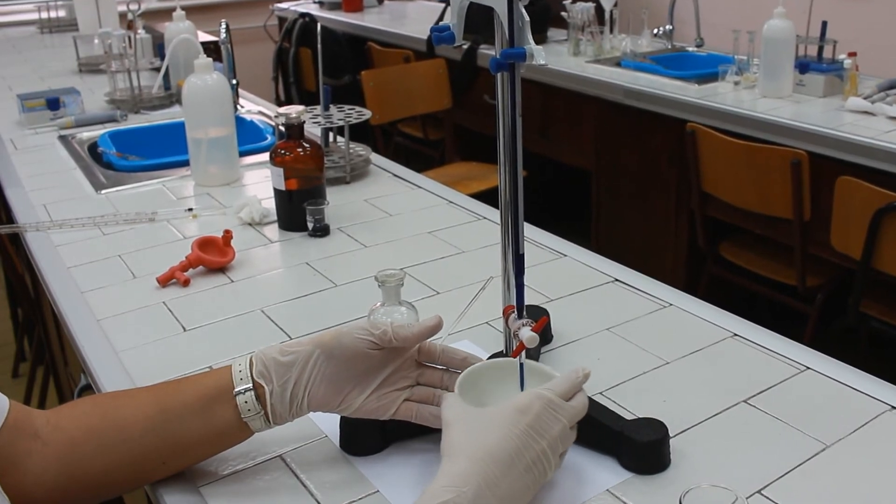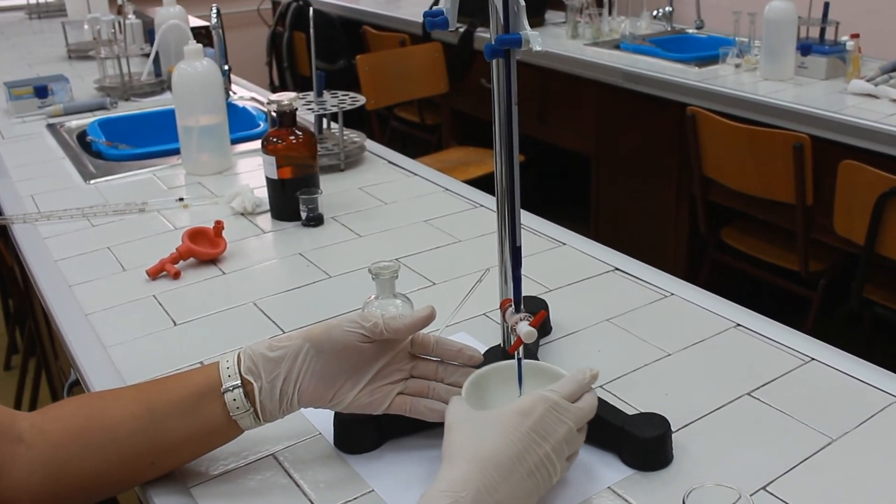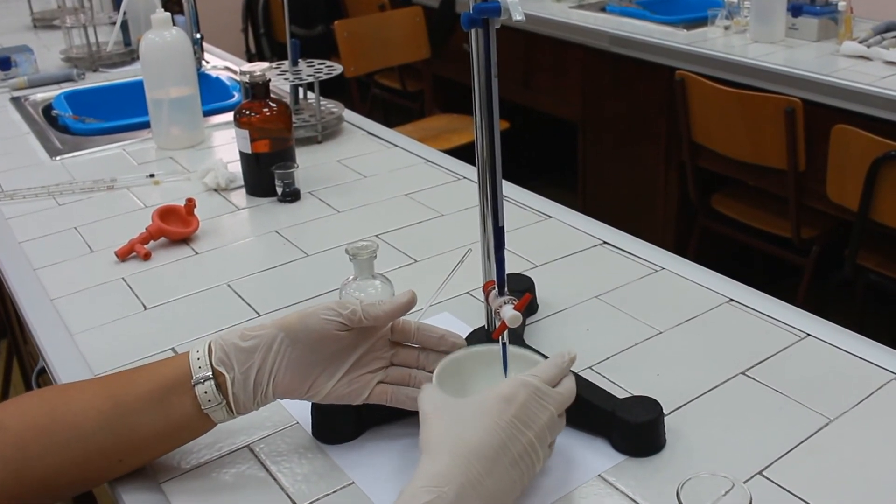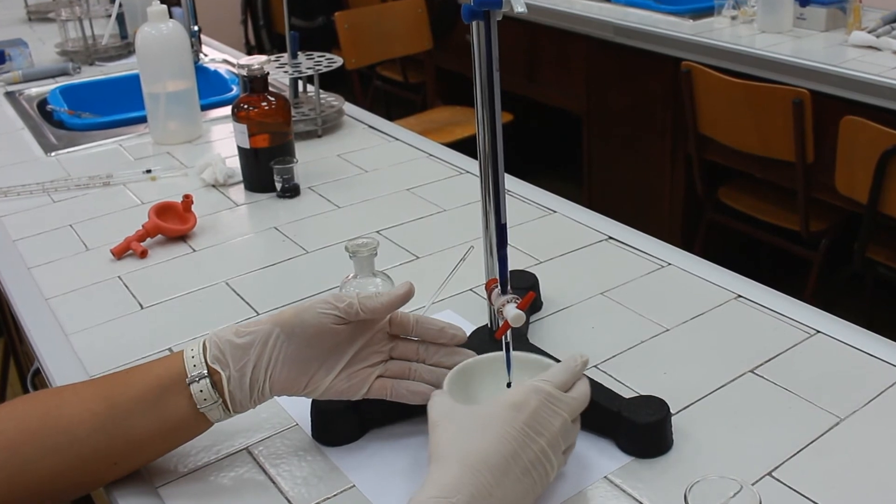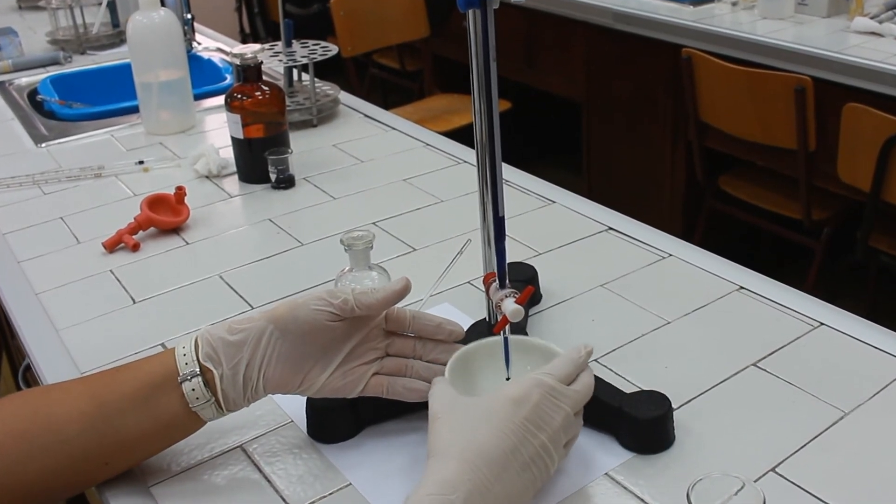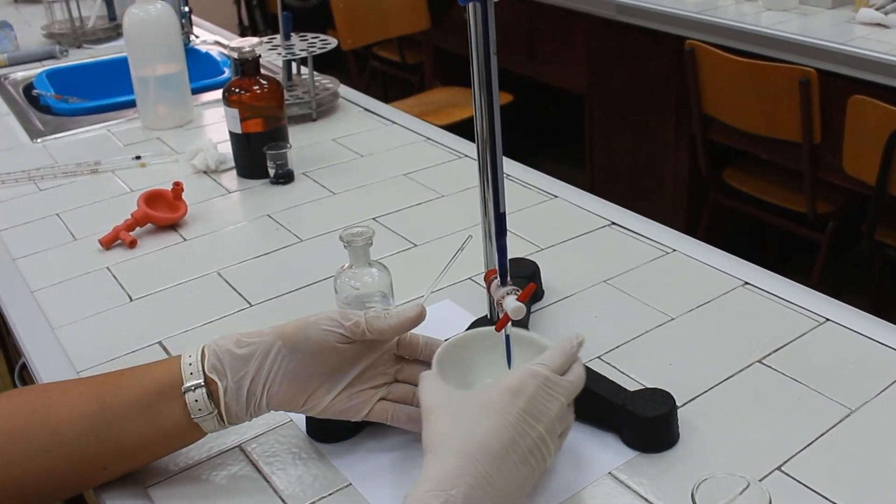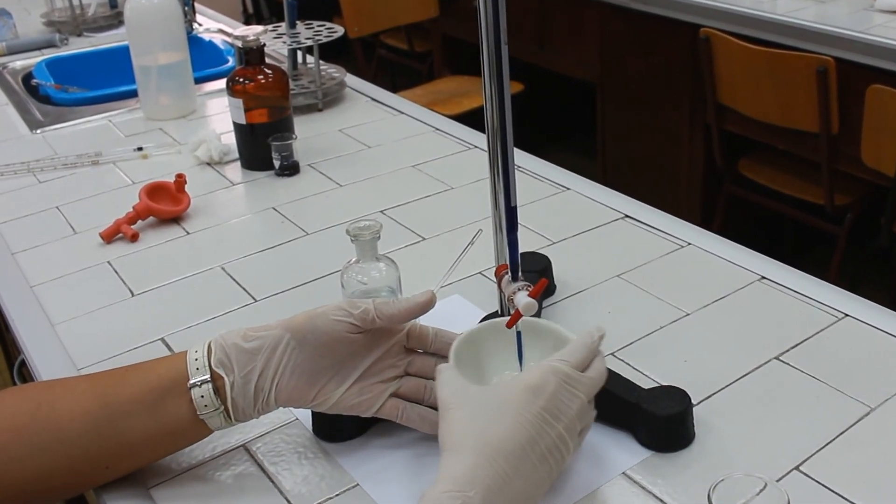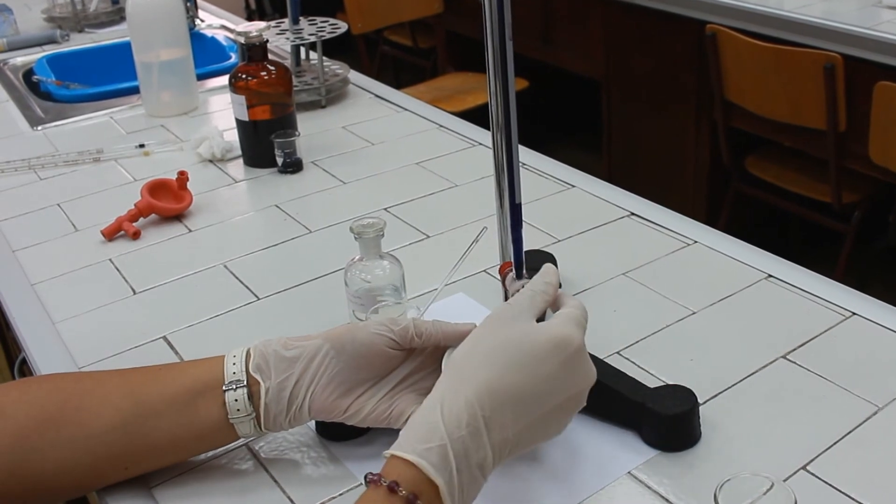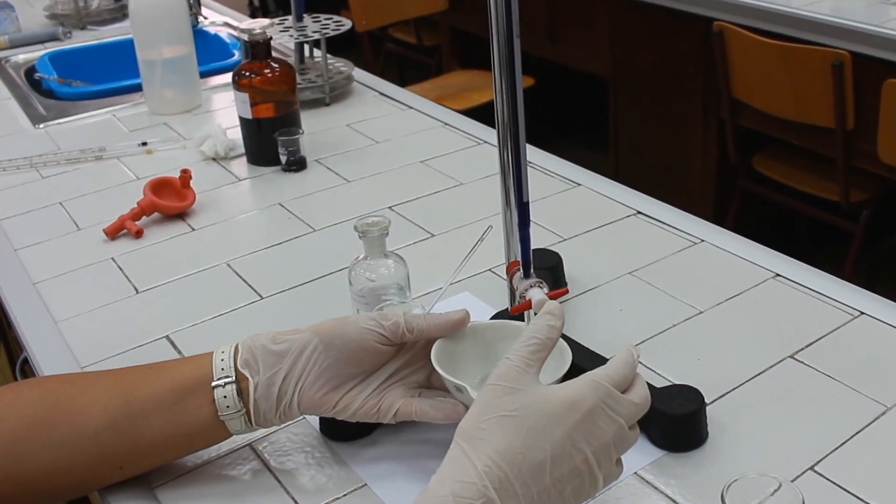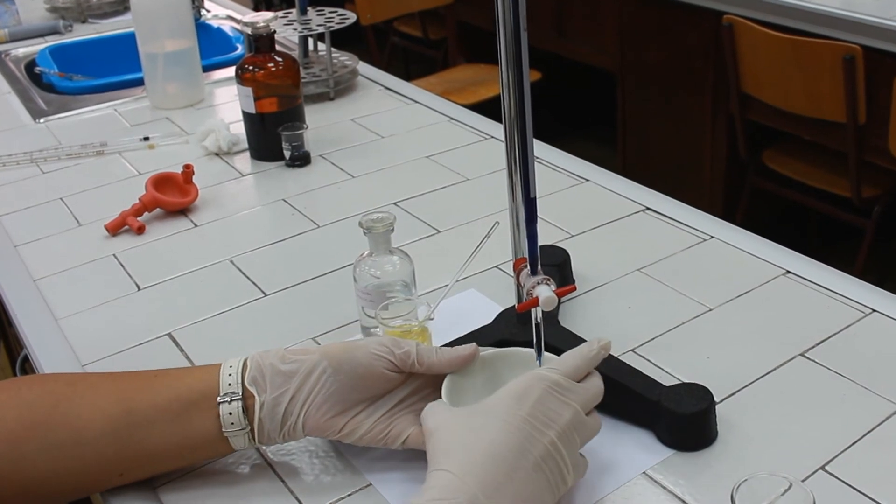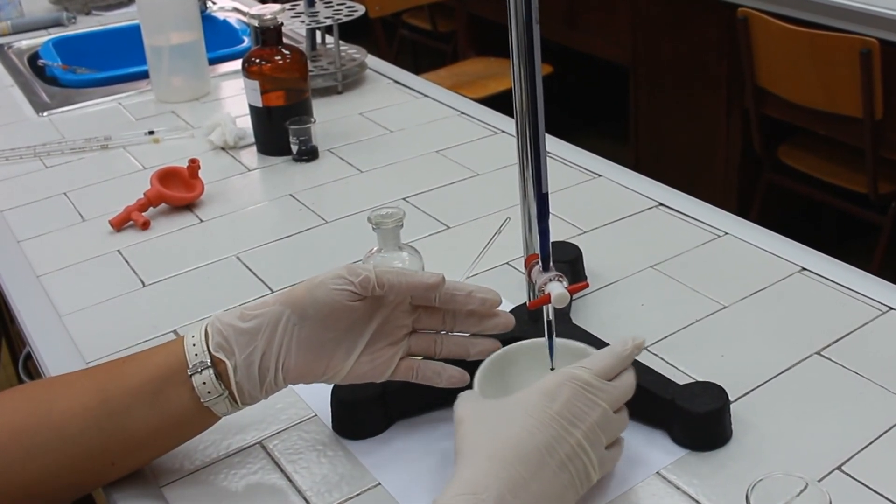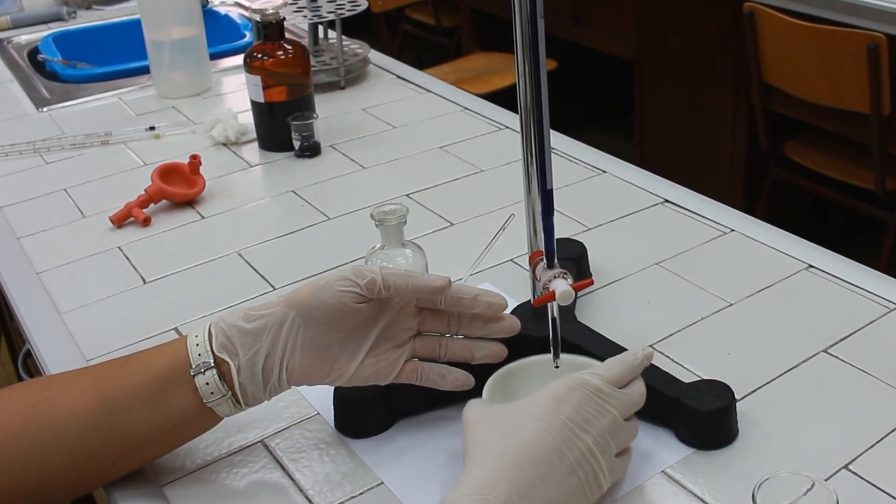The blue drop reacts with the vitamin C and becomes colorless because dPiP is reduced during this redox reaction. But at the end of titration, the blue color drop of dPiP is going to change to red and the color is going to remain stable for at least 30 seconds.